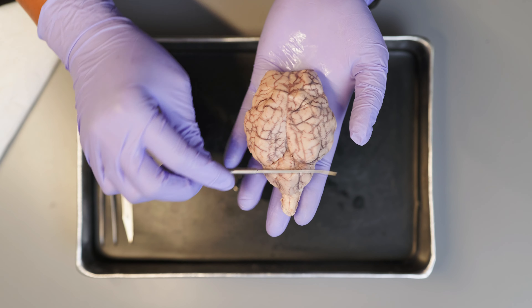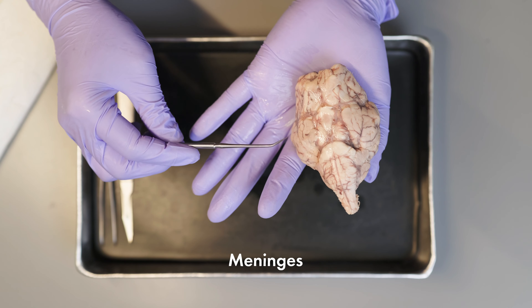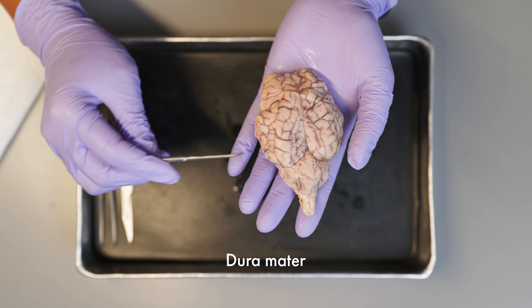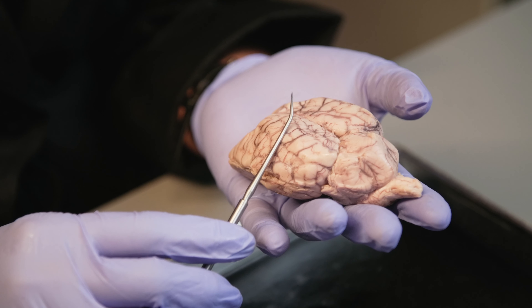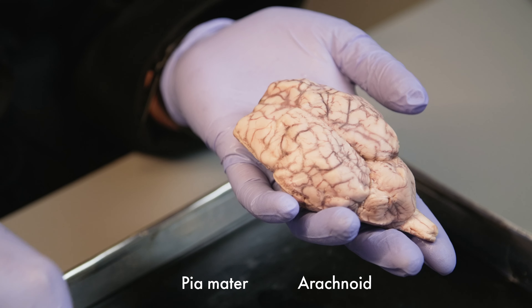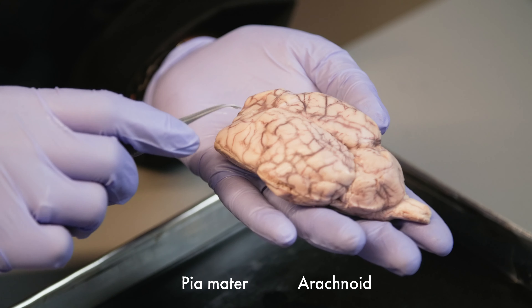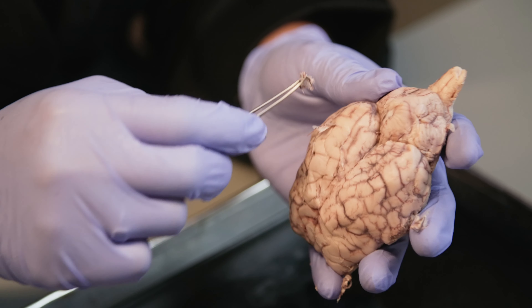First, we are going to observe the outer surface of the brain. There are three meninges that are layered up to cover the brain. The first layer is called the dura mater. This dura mater is thick and dense and covers the brain, but here on our specimen it has already been removed due to the preservation process. The other two layers are called pia and arachnoid. We are going to remove these thin layers gently with our forceps. It will take a while to remove the entire meninges, so if you do this in your classroom, you could just remove part of it so you can see the structure of the brain underneath.